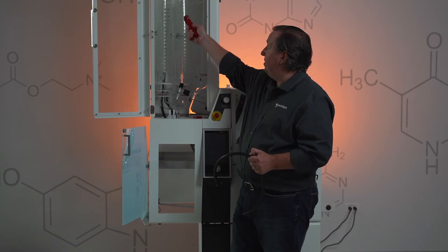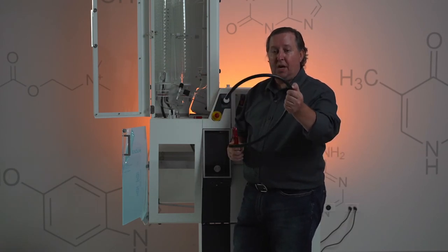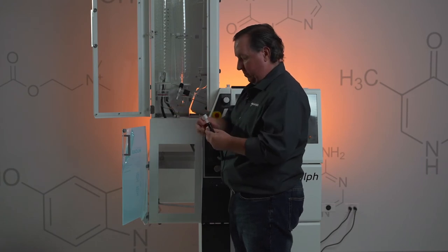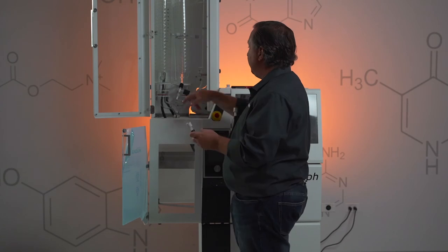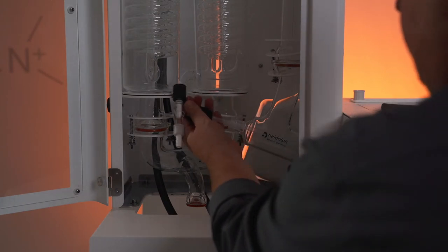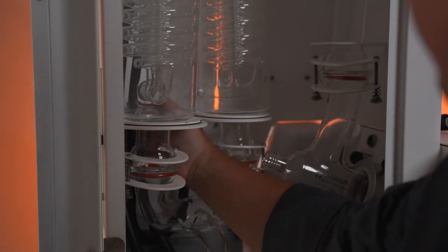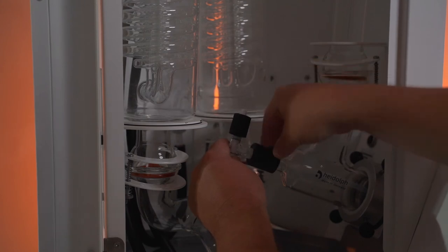Next, we're going to connect both of our condensers. We have our supply hooked in and also our return, but we don't have a path to connect both condensers right now. Cut off about a foot of the black tubing. Take your remaining two hose barbs, connect them to this little loop, and these two will be connected on the bottom connections of the condensers. To connect your little loop, you may want to remove your product feed valve — just unscrew this coupling, remove the entire tube, and it's going to make life a little bit easier getting back to your tube connectors. Once you get that tubing connected, slide our product feed right back into place and screw that in.